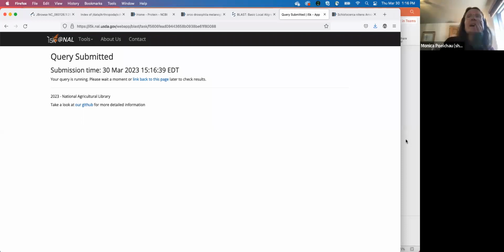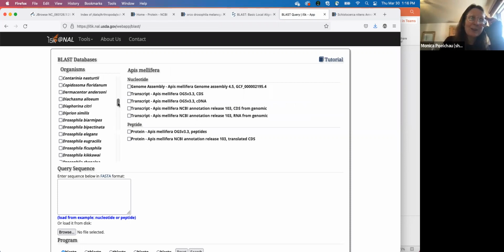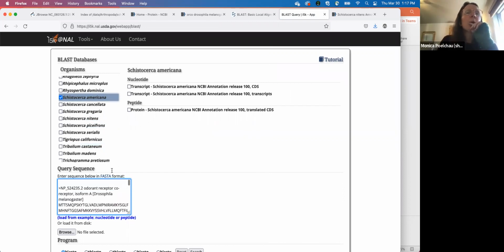And so, the databases that you saw that were available, oh, great. So if you find this, we have a bug that I'll need to talk to our team about for our BLAST that gives you spurious false results. So email me if you find that, but that's not what's supposed to happen. And if it happens, you can also just give the same query a couple of tries. I apologize about that.